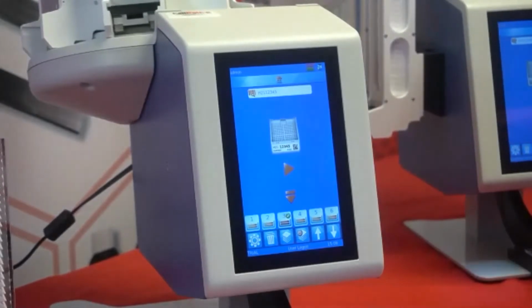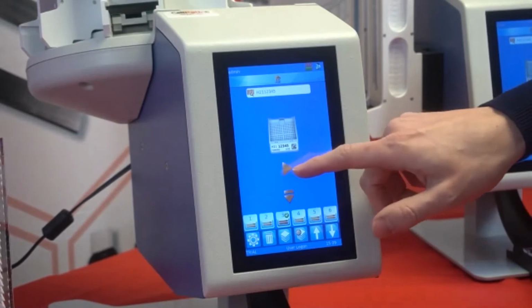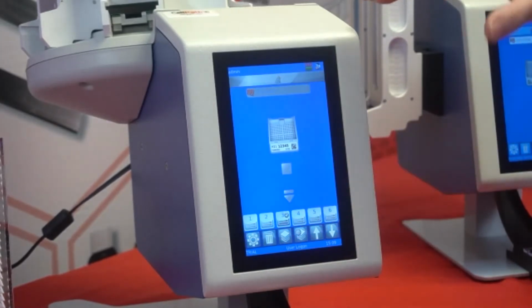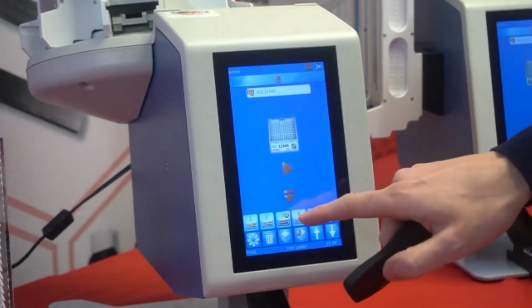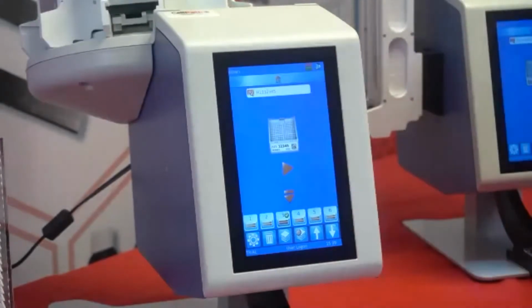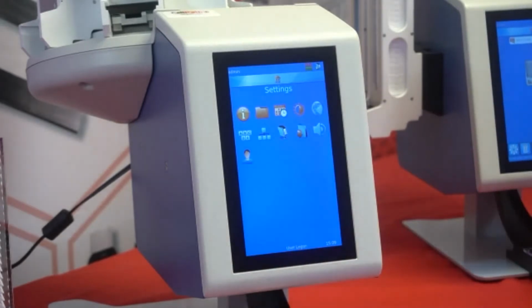We can see that we're greeted with the main page, and it's very self-explanatory here. I've already preloaded some information onto the cassette face, and cassette printing is available at the touch of a button, which would be play. On the hopper version, that chooses what is currently in the position for print. And we've also got the choice of hoppers that are listed here. The green tick highlights that hopper 3 is currently in the correct position. The choice of entering the settings bar is at the bottom here, and this contains a number of icons that ensure the settings are easily navigated.